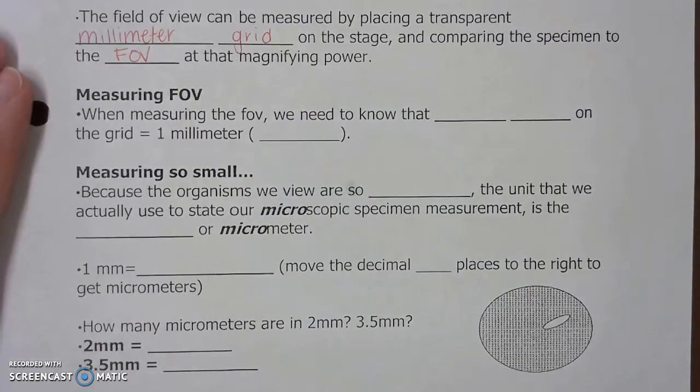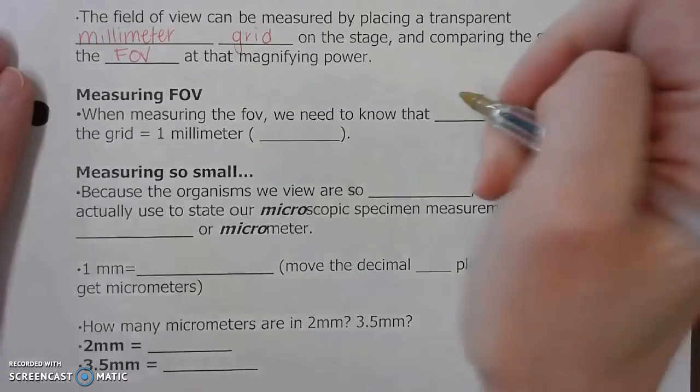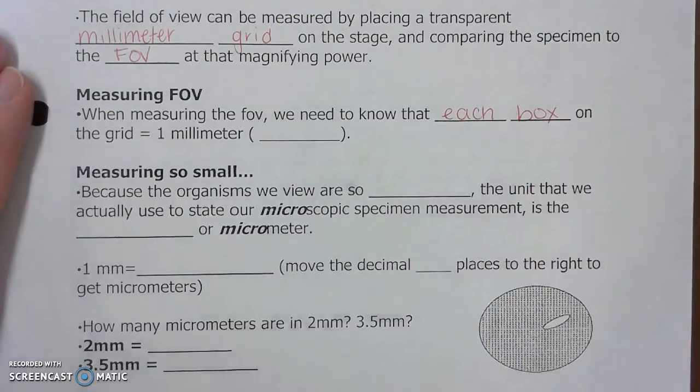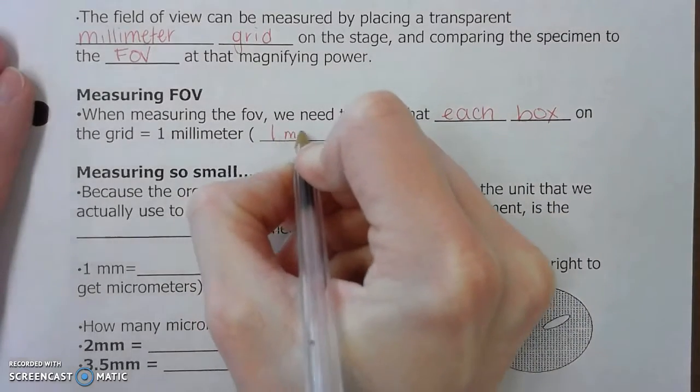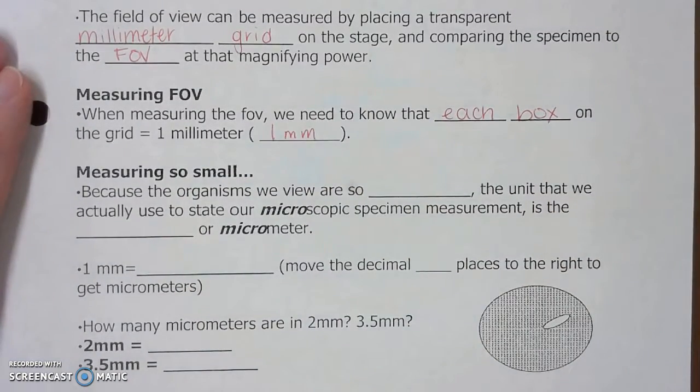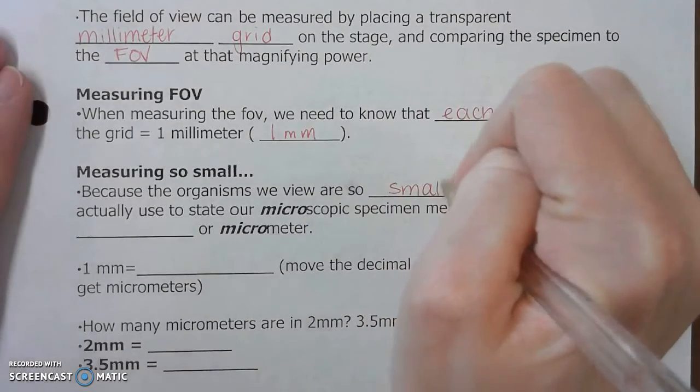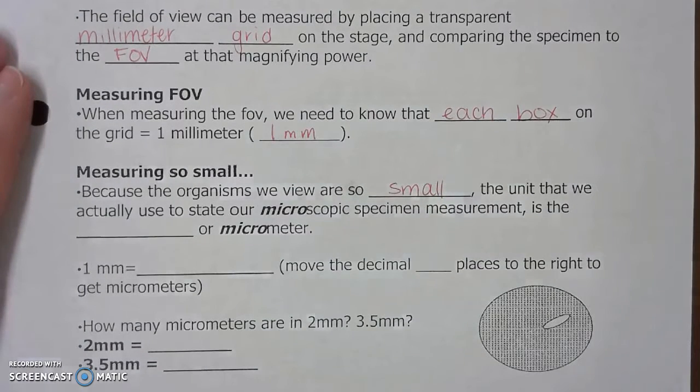Measuring field of view. When measuring the field of view, we need to know that each box on the grid equals 1 millimeter. Because organisms we view are so small, the unit that we actually use to state our microscopic specimen measurement is the micron or micrometer.